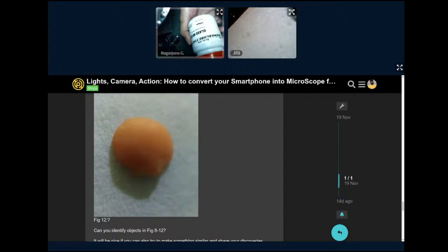See, look at this, 250 grams, which means I will be able to use these beads and make like 2,000 microscopes. Oh my God. So how much does it cost? So don't buy, I'll give you. Yeah. Really, you just lost your opportunity to become a millionaire. So don't buy. Once we succeed in doing it, even if it gives a sufficiently blurry image.